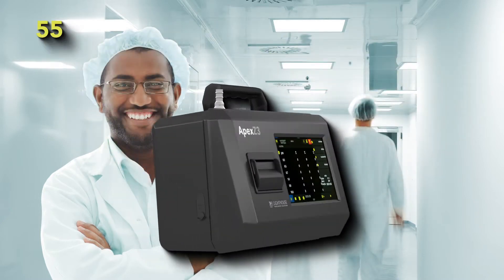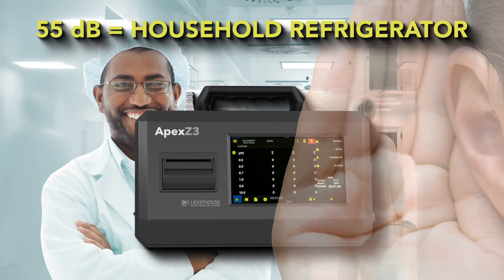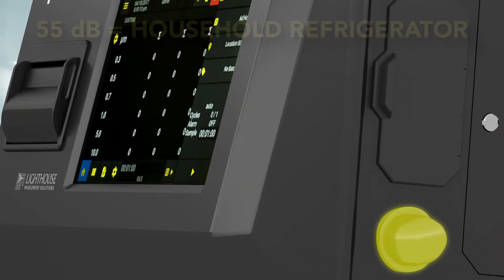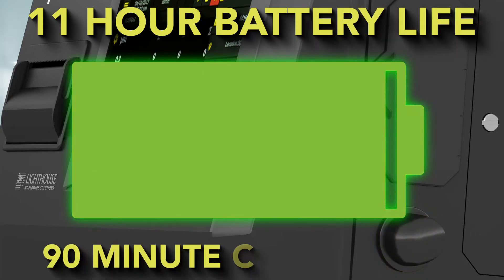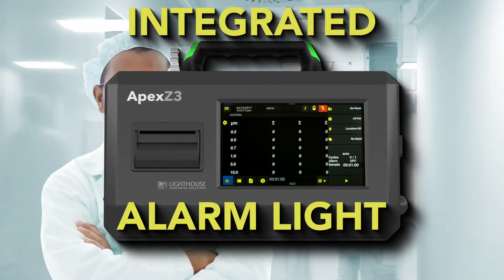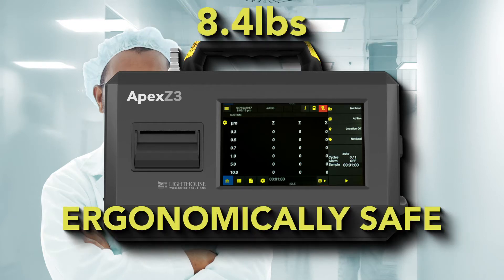The Apex Z is so quiet you will hardly notice it running and comes with a HEPA filter ported exhaust. Sampling is made easy with the longest battery life and shortest recharge time on the market. Coupled with an integrated alarm light, the Apex Z will make cleanroom monitoring a breeze.